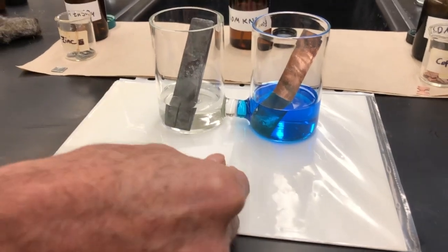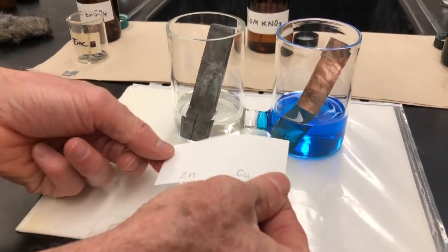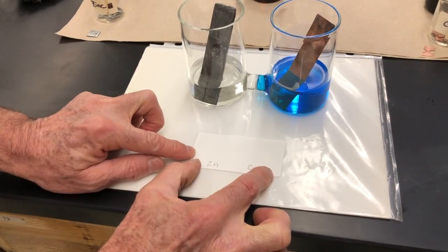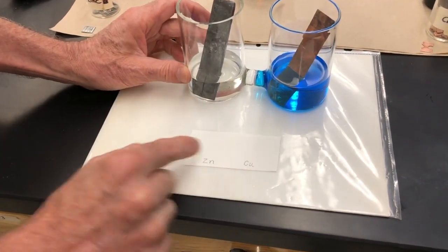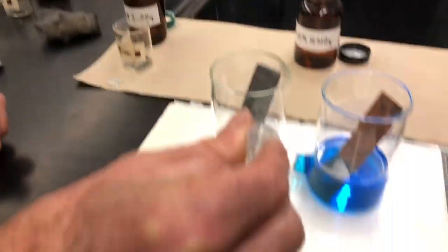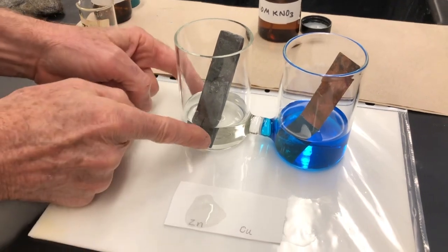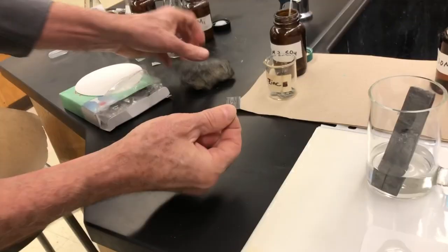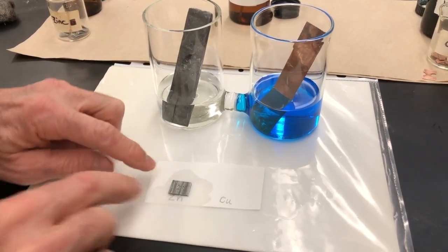For our microvoltaic cell, we have a piece of filter paper that has already been cut into a rectangle, and that filter paper is absorbent. So we're going to use this as both beakers all in one place. On one side of the filter paper, we're going to put a couple drops of zinc 2+ solution — notice it's absorbed by the filter paper. And then we're going to take a piece of zinc metal, which has been cleaned off with some steel wool, and put that on top of it. This is our zinc metal in the zinc solution.